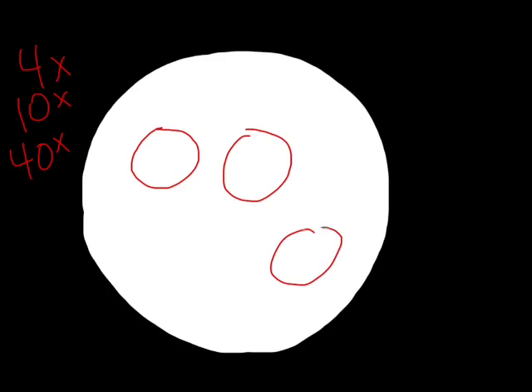Let's actually pick a reference you can relate to and use. Pretend we're looking through the eyepiece right now, and we're on the lowest power. So 4x, but we have the ocular piece at 10x, so it's actually 40 times magnification right now. And we put a slide in there, and we're looking at cells.